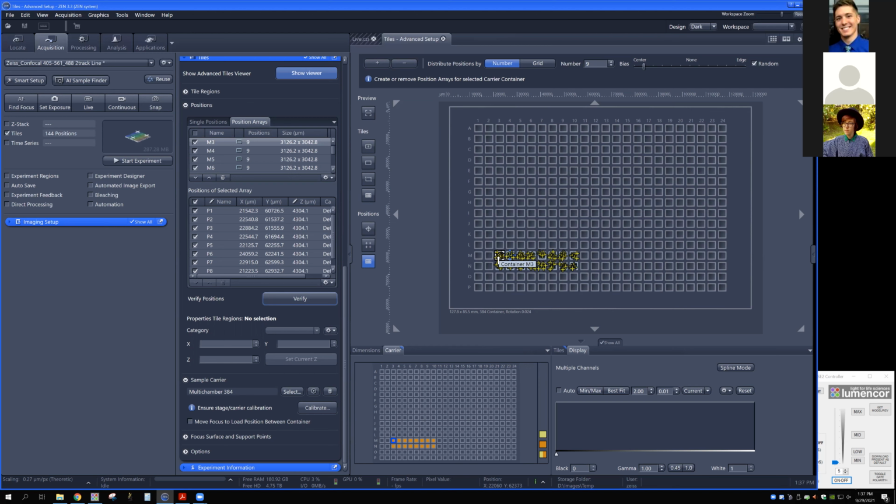But the other thing to mention is if you're doing this with oil immersion, then the problem can be that you can end up introducing air bubbles eventually if you're not careful. But the other nice thing is that it means you don't drag your oil all the way across your tray, such that you end up losing it quicker, and you can go further. I don't know what kind of rules you want to have in place in terms of oiling.